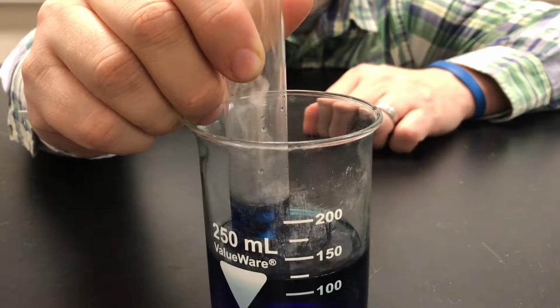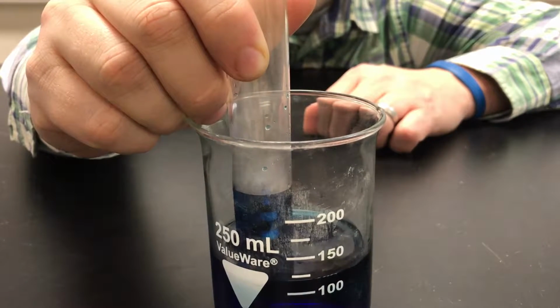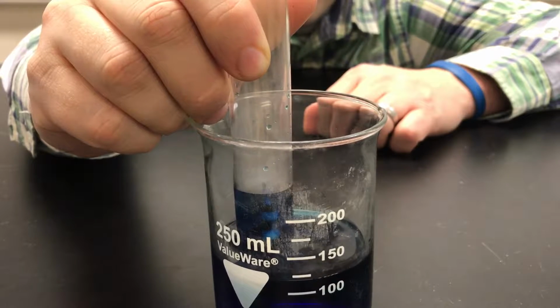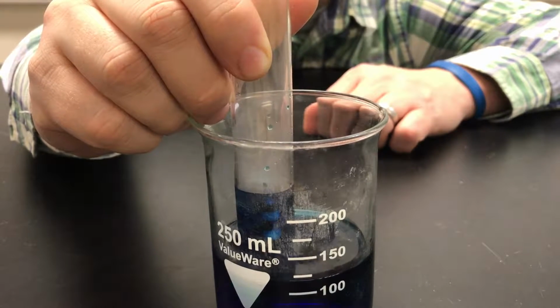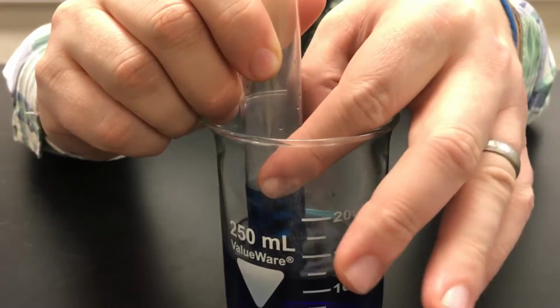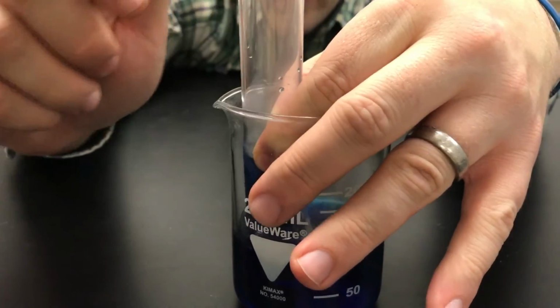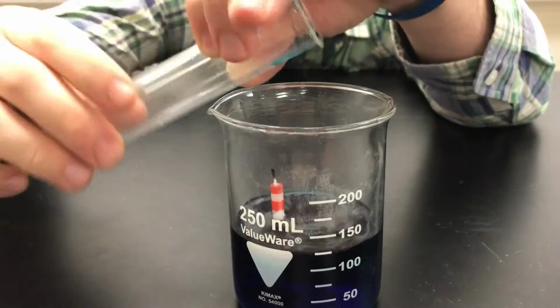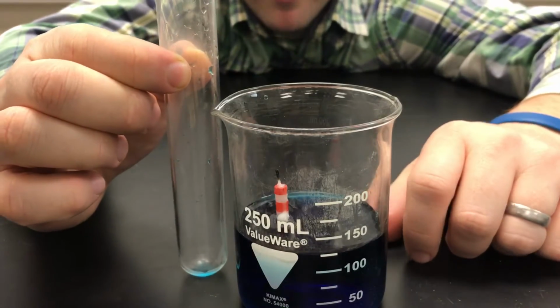So you see the flame go out. Now when the flame goes out, see how water traveled up in the tube? The water traveled up in the tube because the flame used up the oxygen and something had to take up the space the oxygen was in. So that water up in the tube represents the volume of oxygen that was in that air in the test tube. To mark that volume, I'm just going to grab the test tube right to where the water came up to, and I'm going to be really careful to keep my finger in the same spot the entire time.